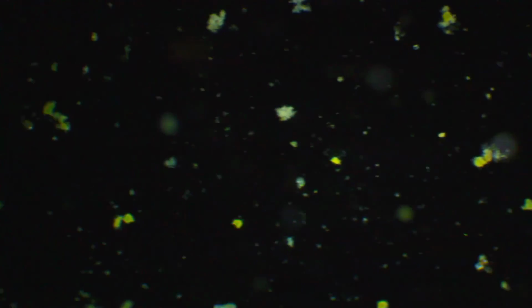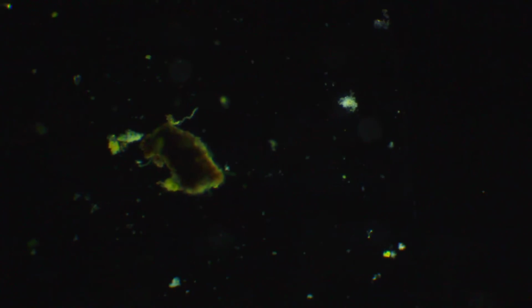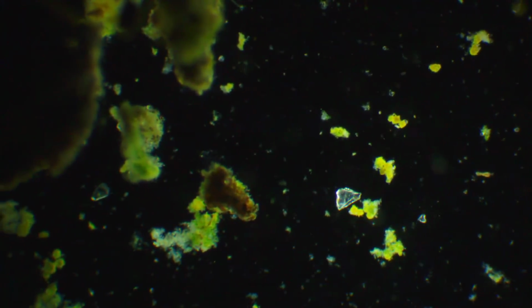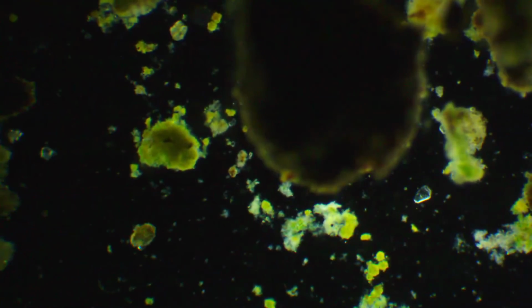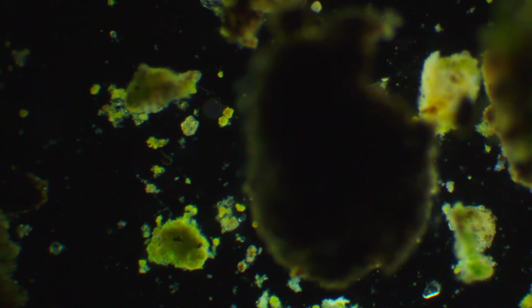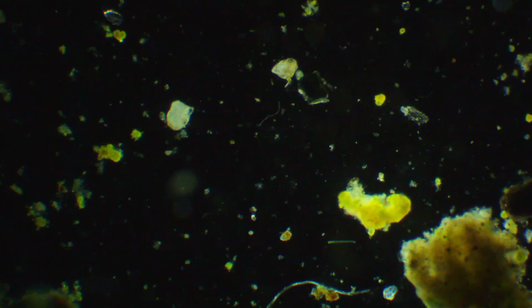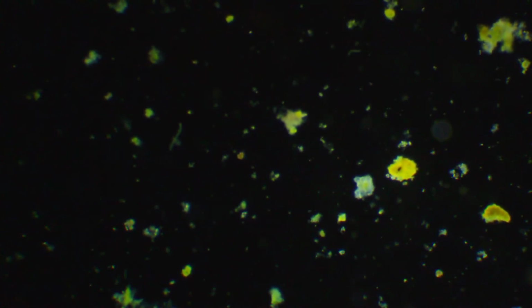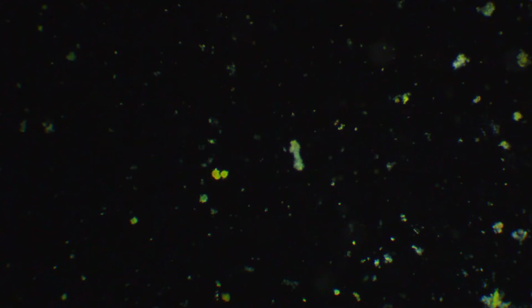So I was kind of disappointed to find basically nothing in these samples, but it was worth a look again. And there's actually more life in here. Like I said though, that could be cross-contamination, because I didn't exactly clean the slide before it, or use a fresh slide. Just kind of reusing the same couple slides.